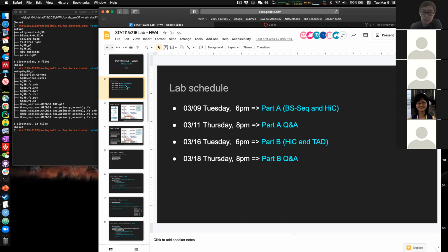If you have any questions working on the homework, which by the way, I recommend you to start earlier, please just as always, feel free to use the Slack channel and post it there with your screenshot, with your scripts and everything, so that we can take a look before the lab, before the Q&A session, and other students from the class can also help. Some of the questions may be shared between different students, and you're definitely usually not alone. So if you post it there, it will be helpful for yourself and also helpful for the other students. Okay.